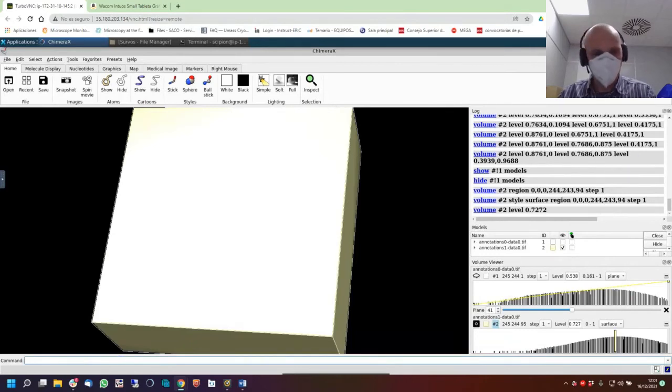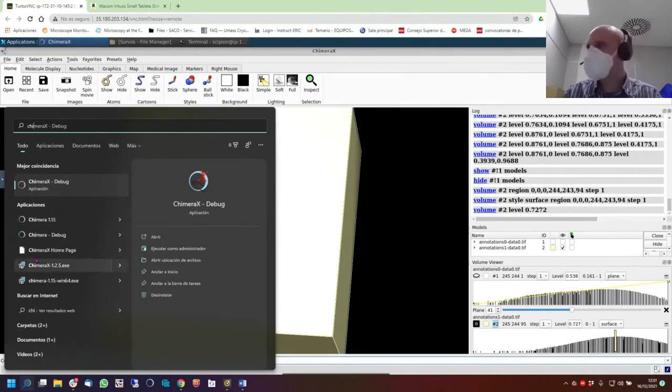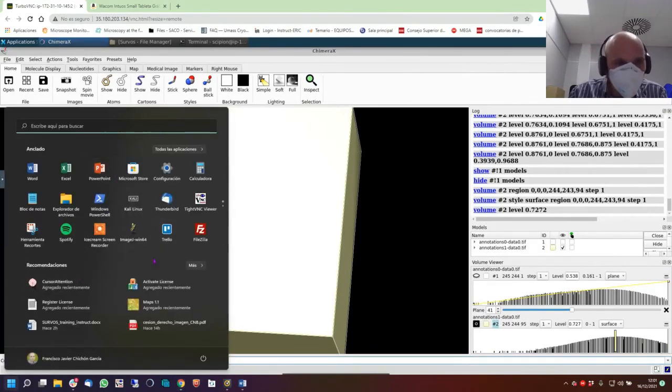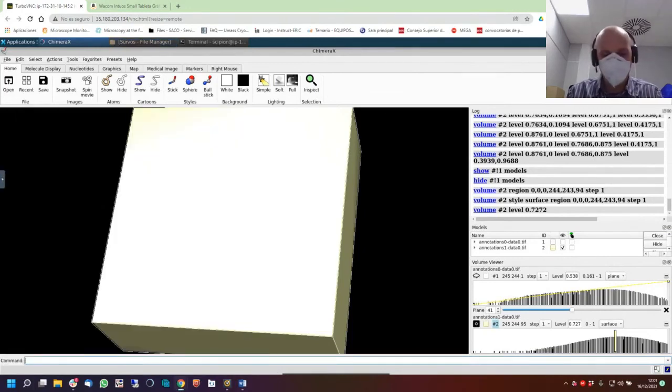Where is ChimeraX? It's not here in my folder. ChimeraX. Oh, damn! I didn't find it. I didn't open my own stuff. Let's keep opening the rest. Let's go here and try to find it. Like this. Up both faces.